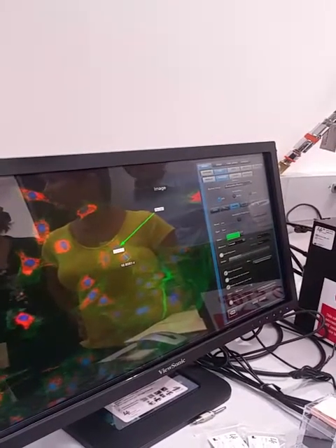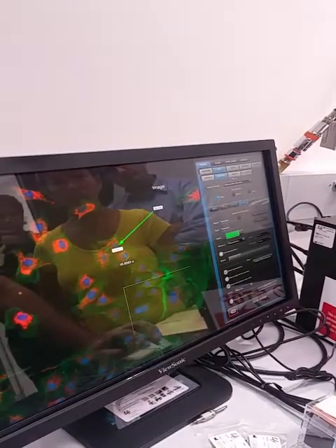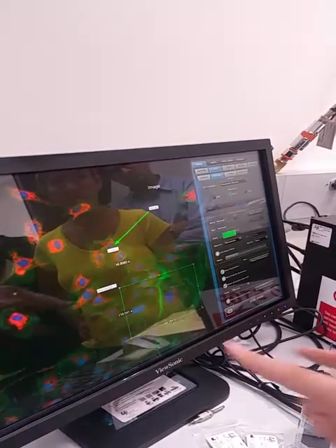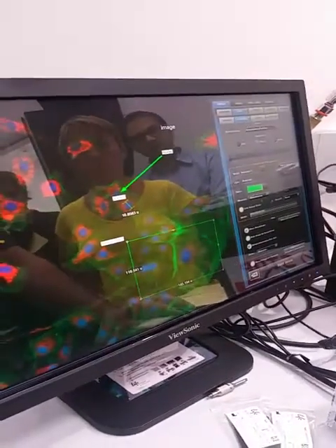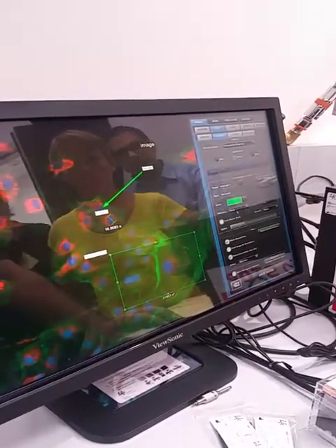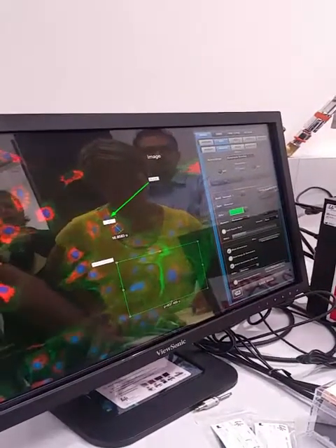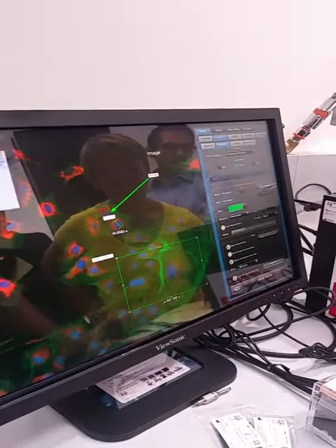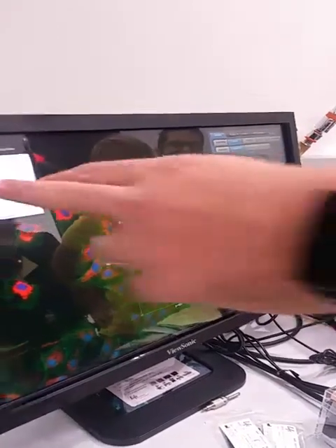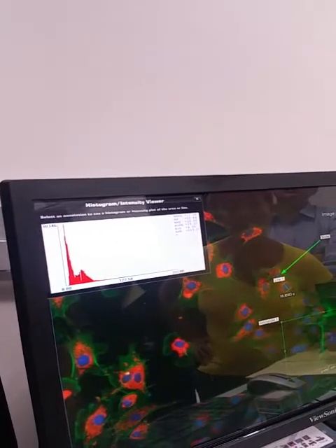These final three buttons allow you to select areas to measure overall intensity. The first option lets you create a rectangle. Right now it gives the dimensions of the rectangle, but you can click your measure bar to get the area or perimeter instead. To get overall intensity, you click 'Show Histogram,' which gives you the overall intensity. Because we're in an overlay, it gives us all three channels together.